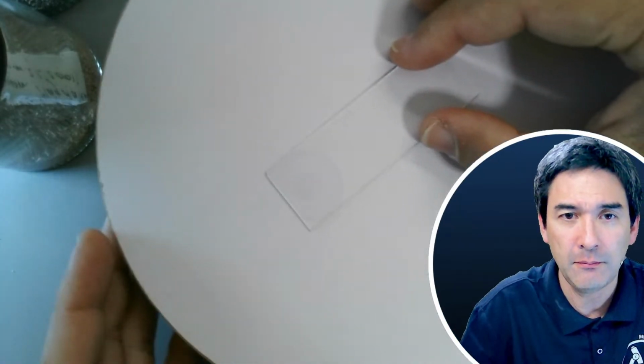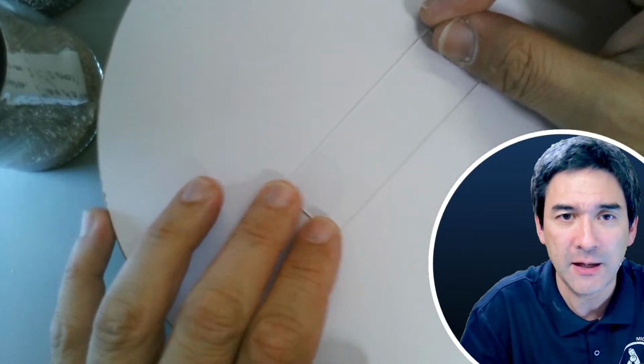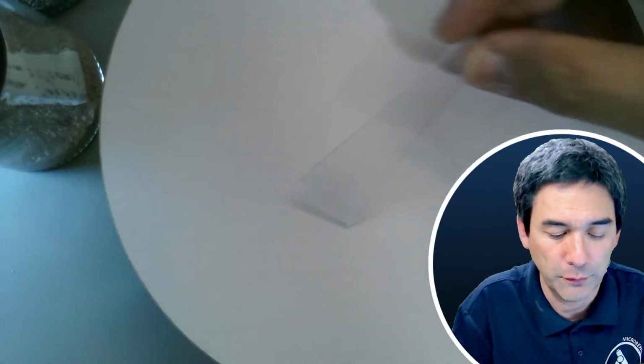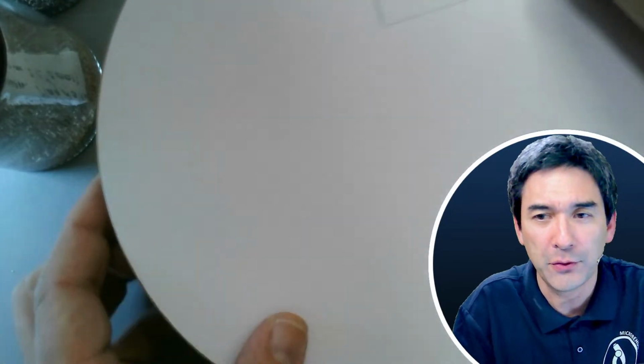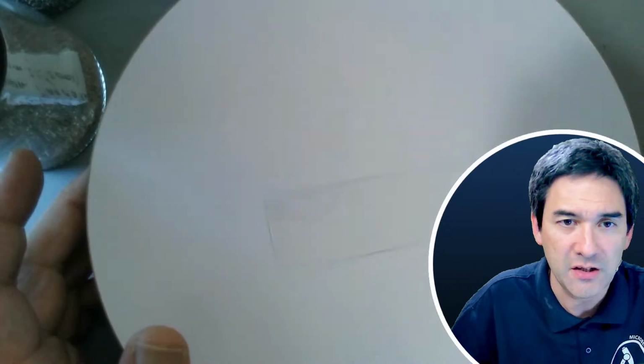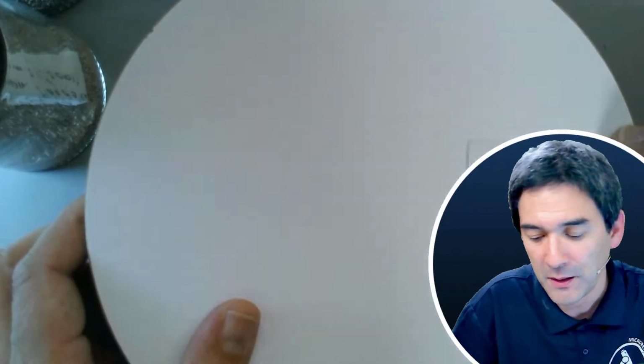But of course, if you have something like this, you might also think of taping a slide on here and then spinning it, and then you're also able to do that. I'm not going to be using this here, but I just wanted to show it as a kind of proof of concept. I bought this over Amazon. This is another possibility, but I did not try it yet. I see no reason why it shouldn't work.